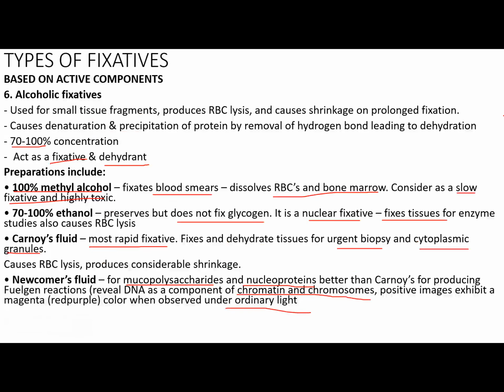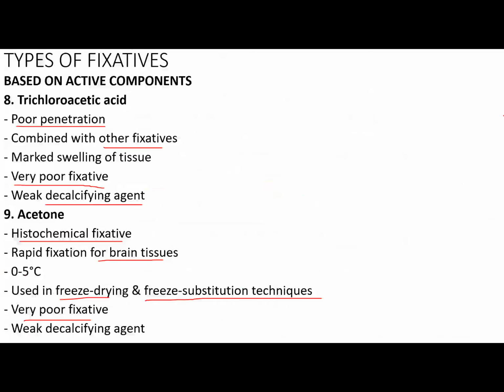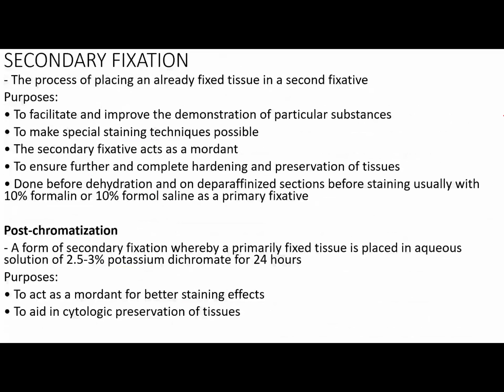So that's basically the summary of the entire fixatives. So I hope you could memorize this. This will definitely come out in your quiz and even in your exam. Now we're done with your fixation, primary fixation. Now there's a process known as secondary fixation.